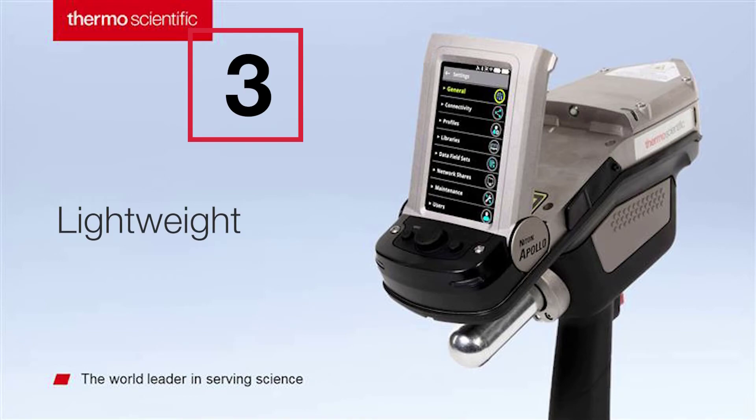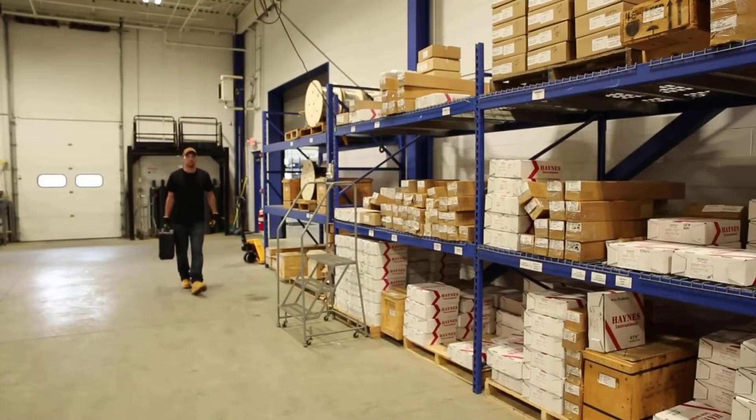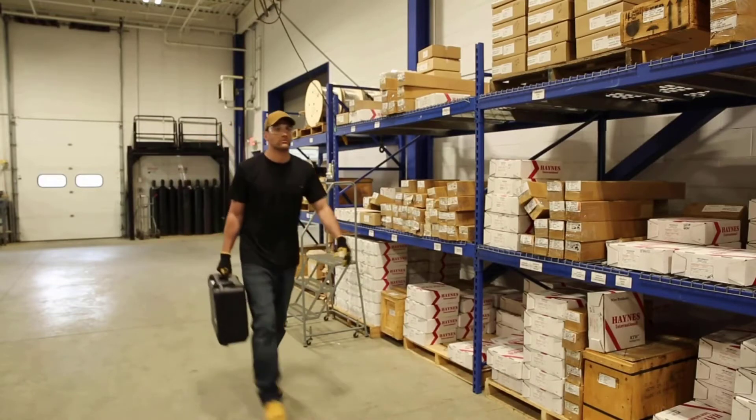Increase your productivity and ditch the heavy equipment. Weighing 6.4 pounds, the Niton Apollo is designed to tackle the toughest environments.